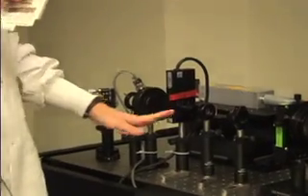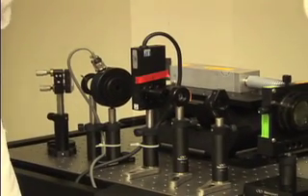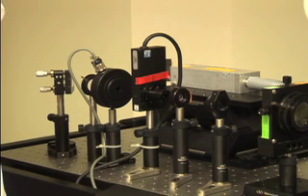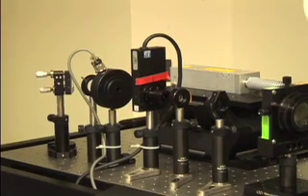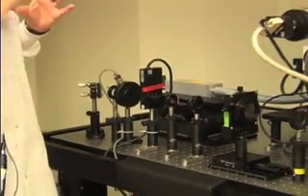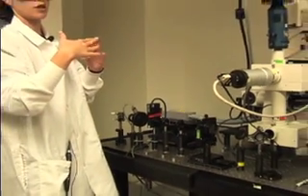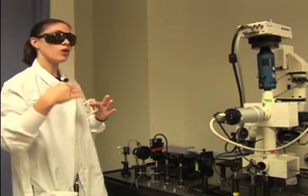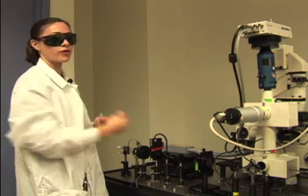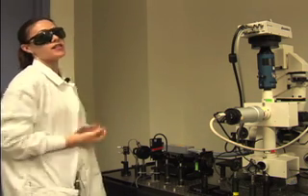What this polarizer does is it can rotate in this mount and when it starts to turn, it decreases the laser power in the focal volume where we have our trapped sperm cells. And as that power decreases, the force exerted on the sperm decreases. And at some point, that sperm's swimming force will overcome the laser trapping force and the sperm will be able to escape the laser trap.